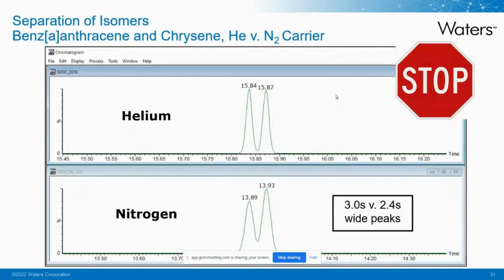So now, part of this work was being done in the first quarter of this year, and we did actually get a notification from our gas supplier that they were exercising the force majeure clause within our contract and might not be able to deliver any more helium for the remainder of the year. There was some subsequent easing on that, but that brought us to a full stop with a quick evaluation of nitrogen as the carrier gas.